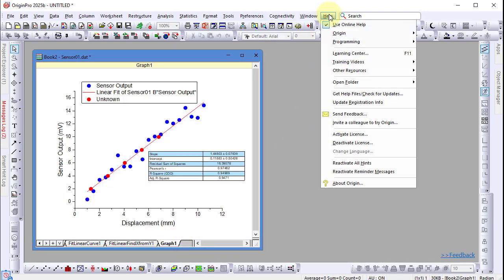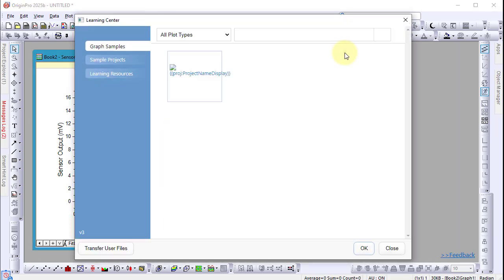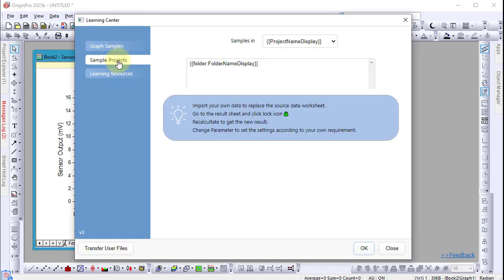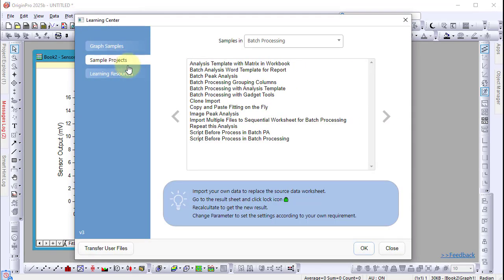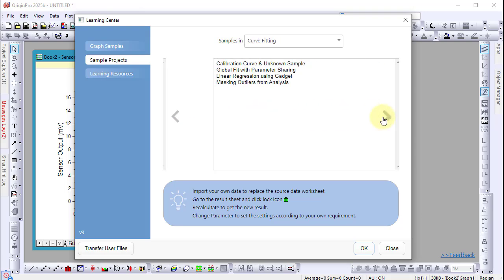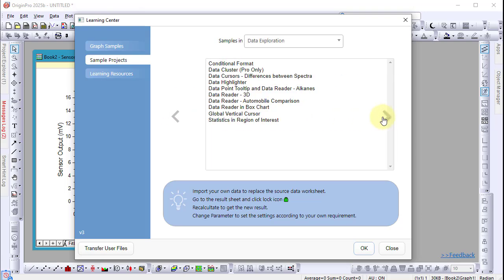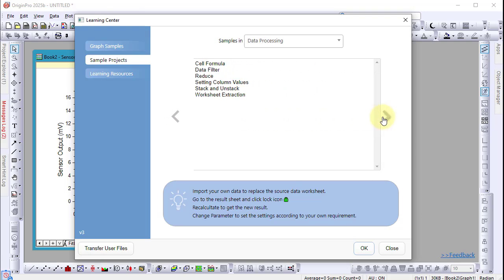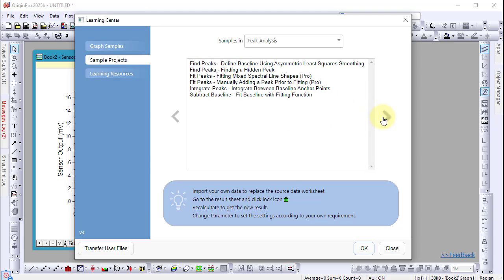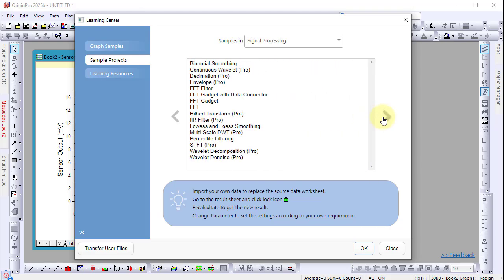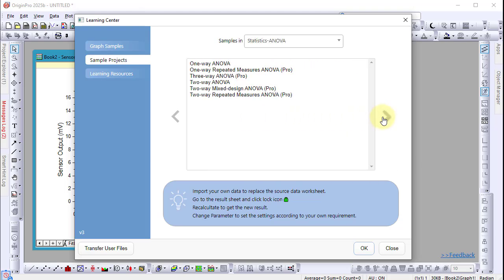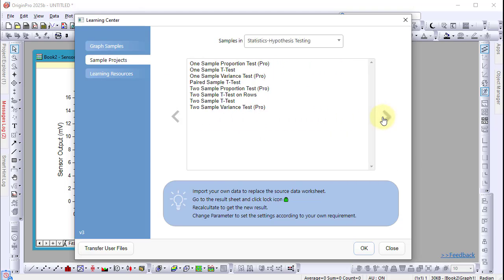Lastly, go to the Learning Center for more examples of analysis tools. There are examples of batch processing, fitting, peak analyses, statistics, and more.